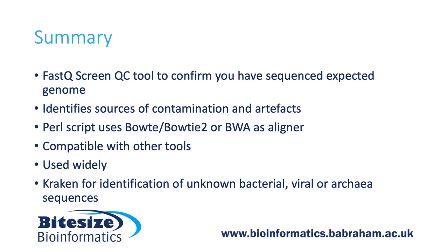Using FastQ Screen is also a good way to check for other potential problems and artifacts which may have occurred during sequencing or the library prep stage. For example, running the software is a good way to identify datasets with a high proportion of low complexity reads. FastQ Screen itself is written in Perl, and it uses either Bowtie, Bowtie 2, or BWA as the aligner.